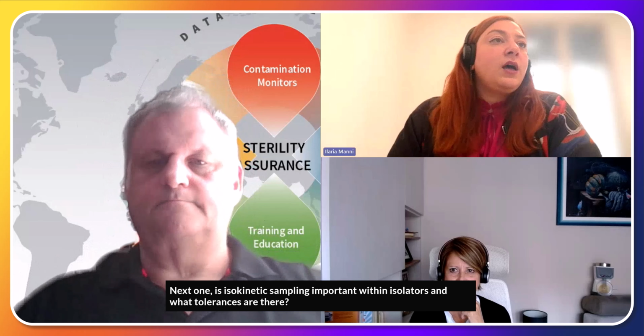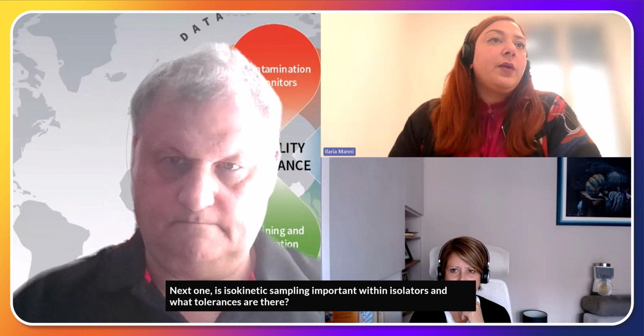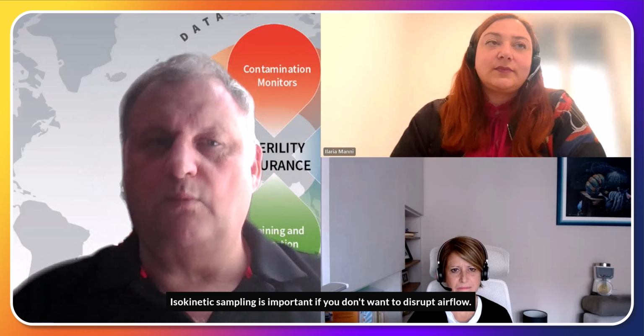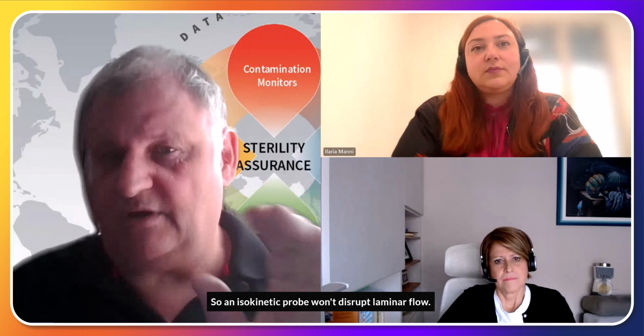Next one, is isokinetic sampling important within isolators, and what tolerances are there? Oh, I'm guessing that's me then. Isokinetic sampling is important if you don't want to disrupt airflow. And there's a difference between disrupting airflow and disrupting laminar flow. So an isokinetic probe won't disrupt laminar flow.